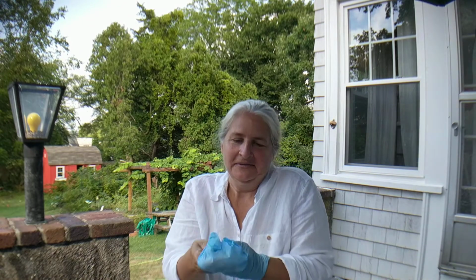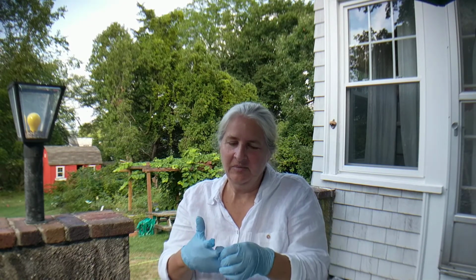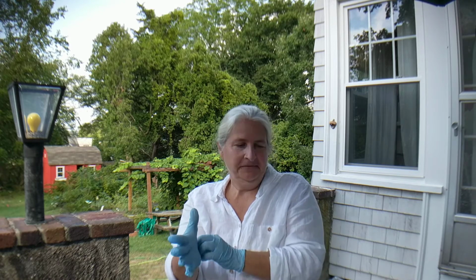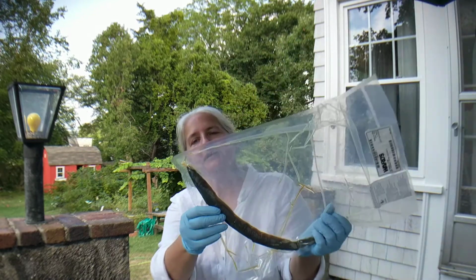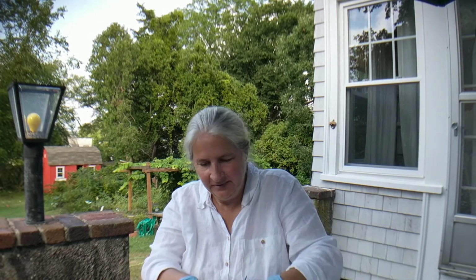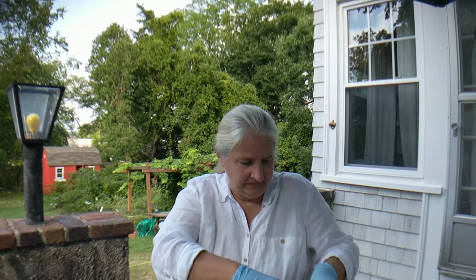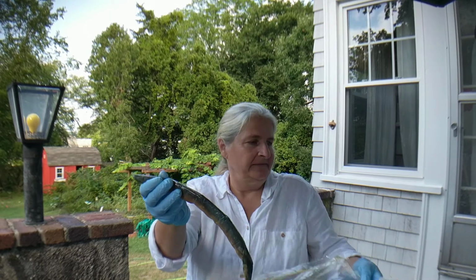Hi, we're going to do our lamprey dissection right here on my back porch. First I'm going to show you how the lampreys come. Sorry you guys don't get to do this exciting thing. It comes in a little vacuum pack, and you just open it up like this. And here's the lamprey.